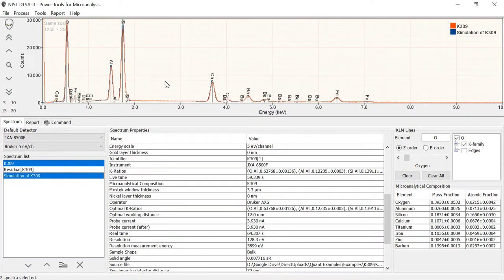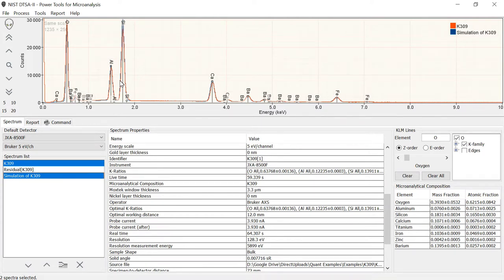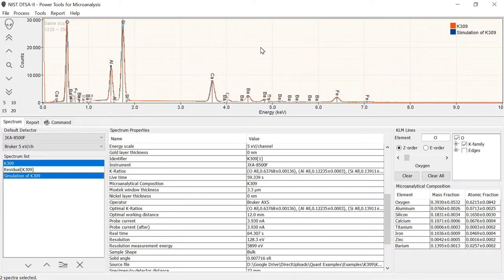You can see that the simulated spectrum, while not fitting perfectly - the silicon simulated is maybe 10 percent higher than the measured - that in general the agreement between the simulated and the unknown is fairly good.